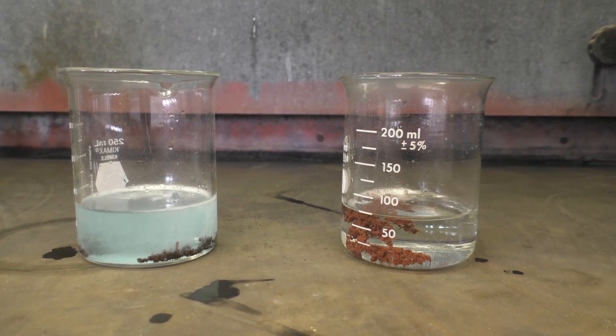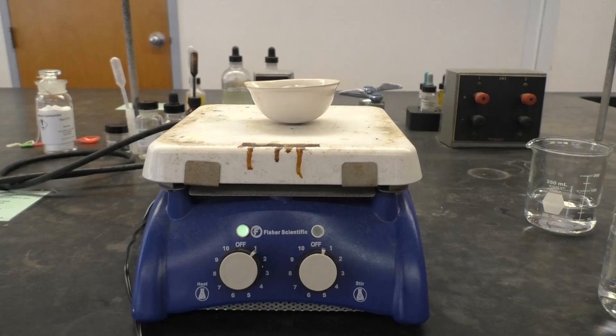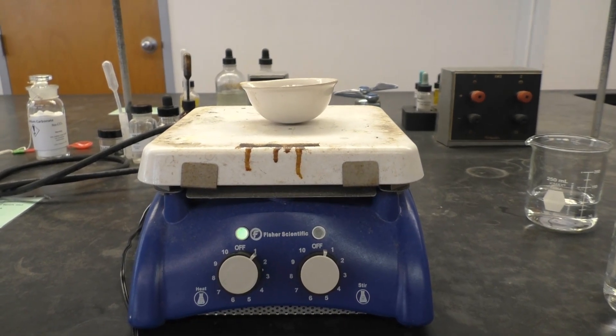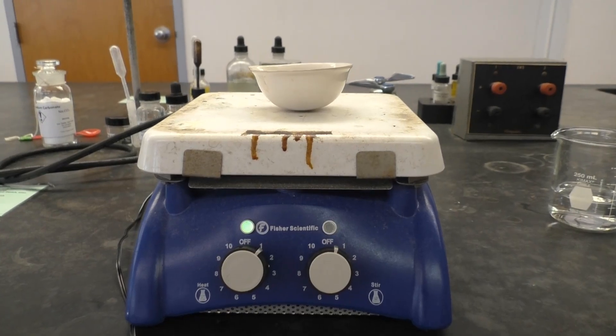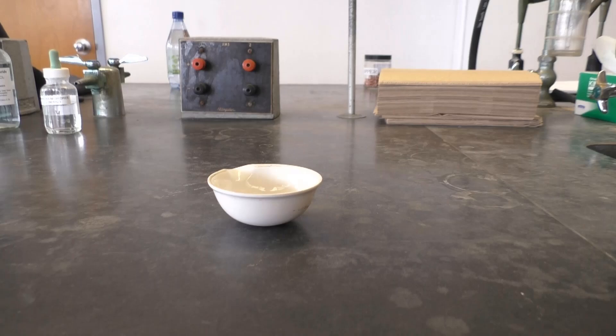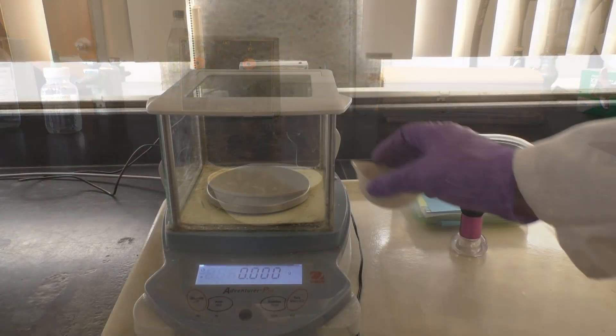Now that you have your final copper metal product, all that's left is to isolate and dry it to obtain your percent recovery. To obtain an accurate mass of your final copper metal, you need a completely dry evaporating dish. Thus, you'll need to heat your dish for about 5 minutes to dry off any water. After allowing your dish to cool, you can then obtain its accurate mass.